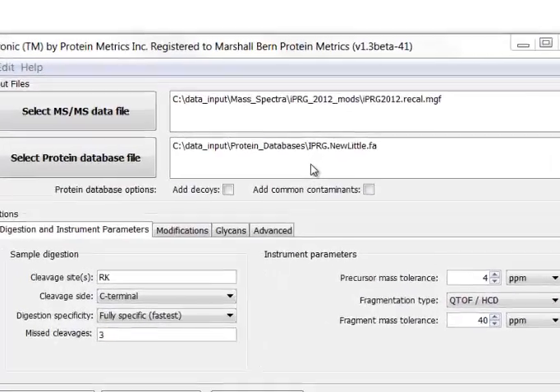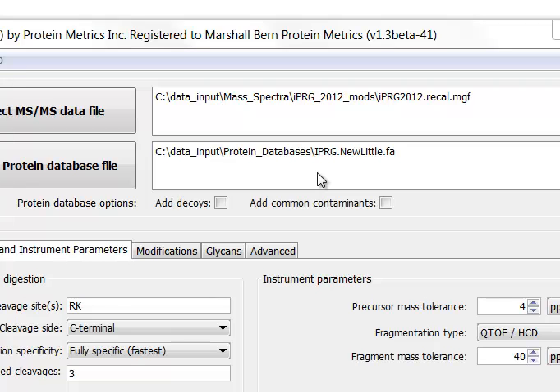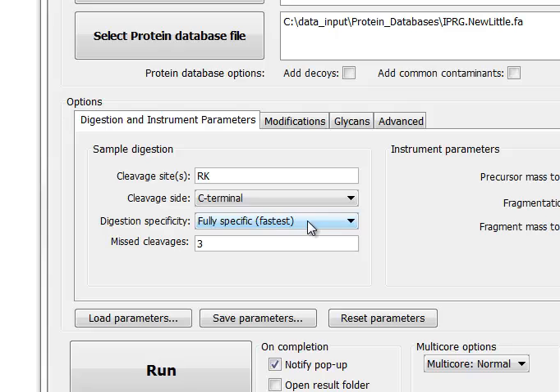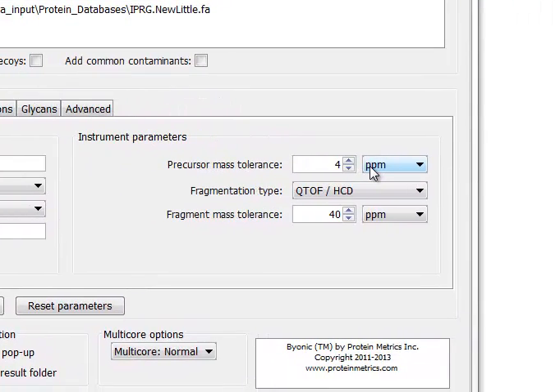Here's how we search this data using Byonic. For the purposes of this demo, we use a focused database containing about 1,100 target proteins instead of the full IPRG database of 42,000. This will give us a 40-fold speedup. We chose a fully tryptic search, and we set precursor mass tolerance to four parts per million and fragment tolerance to 40 parts per million.